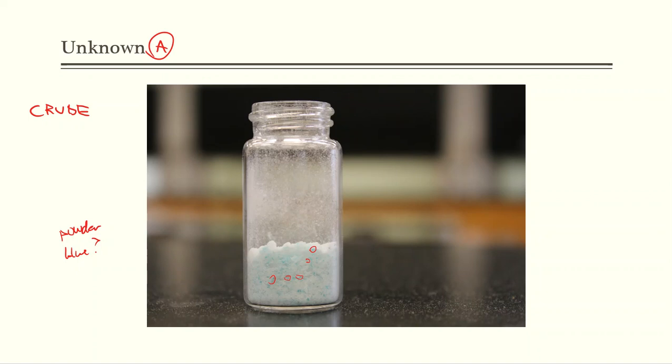So what you're seeing on the screen right now is a dirty benzoic acid sample. It's stated there in the lab. It's letting you know what it's supposed to be, but I can visually see the contamination here, which is why we like to do this lab. So that way you can see it is contaminated. Very often, this might not be colored, and you might see this white powder, and it might look clean to you, but maybe the contaminant is a white powder as well. So there would be no way that you would know that contamination is there.